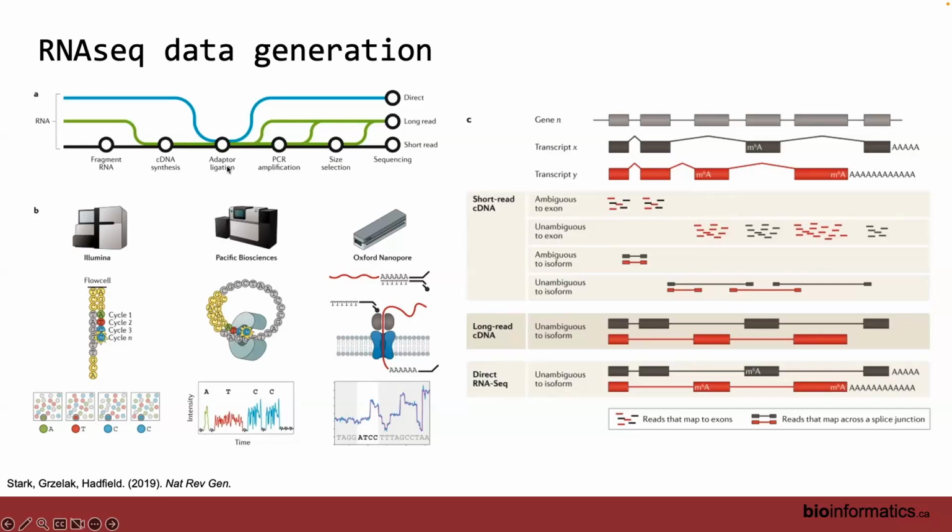Adapter ligation. If you sequence something that has adapters ligated, you better have some way of informatically taking those adapters off later. And yes, you do. And which adapter, what's the adapter sequence? Well, it depends which chemistry of Illumina you are using. So these are some things that you will be more aware of if you know what the process is. And then finally, for short read sequencing, there's some kind of size selection, again, to deal with the limitation of the sequencing technology. And then you get what's called a read.